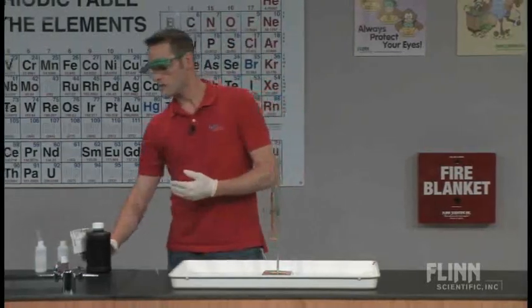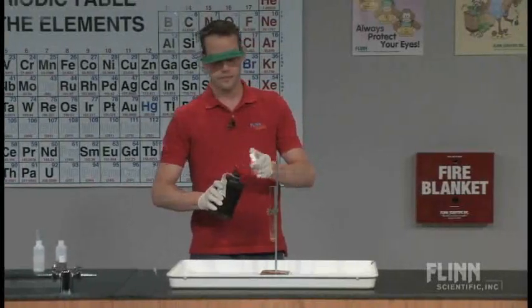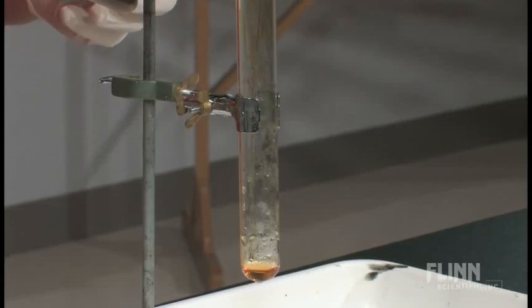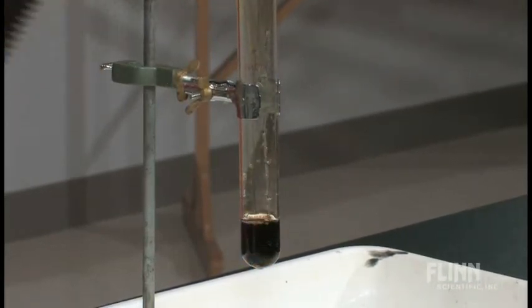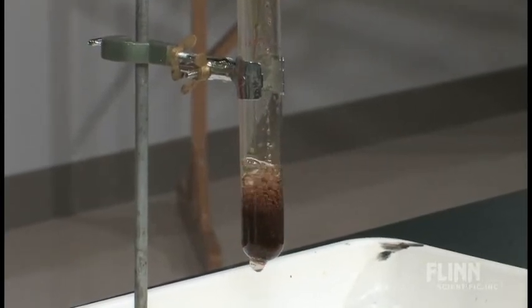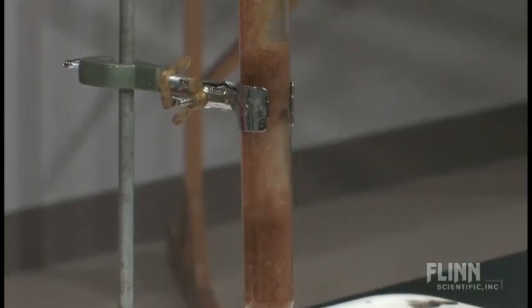So if I pour some more hydrogen peroxide in here, we should see the exact same chemical reaction. And I'll pour just a little bit this time because we just want to see the bubbling. But you can see again that dark brown reaction intermediate is formed, the rapid evolution of oxygen gas.